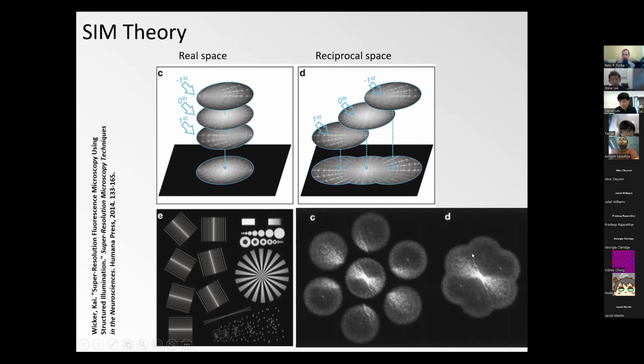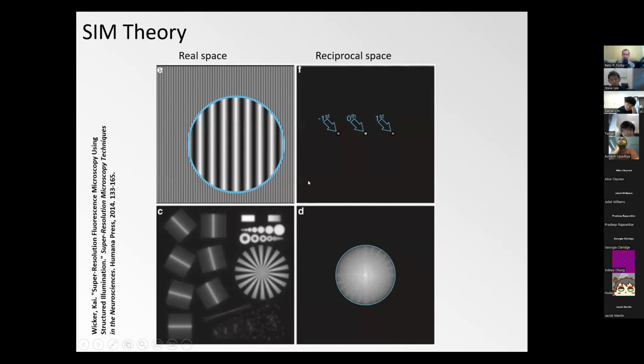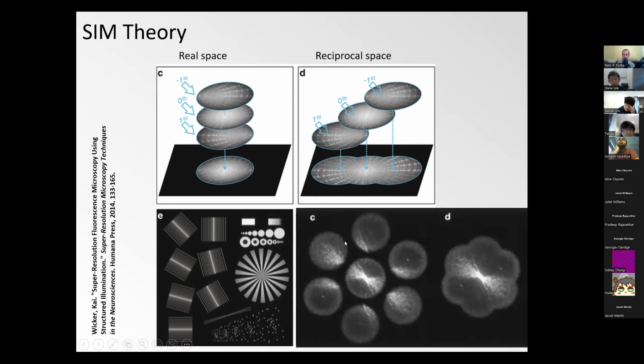And this is actually experimental data from one of the seminal papers from Mats. So there were some directional features, like I think microtubules, and they had Fourier components that radiate out. So similar to that computational sample shown here, but actually done with real data. And you can see that some of these side bands carry some of these Fourier components that radiate out from the center nicely, which otherwise would have been lost.